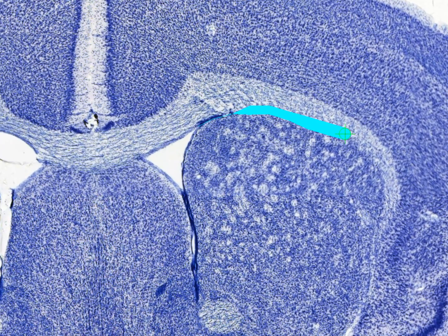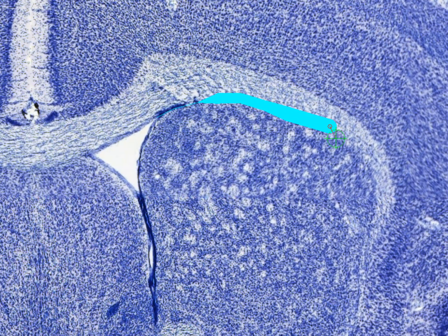Continue tracing and altering the thickness of your contour by scrolling the middle mouse wheel.